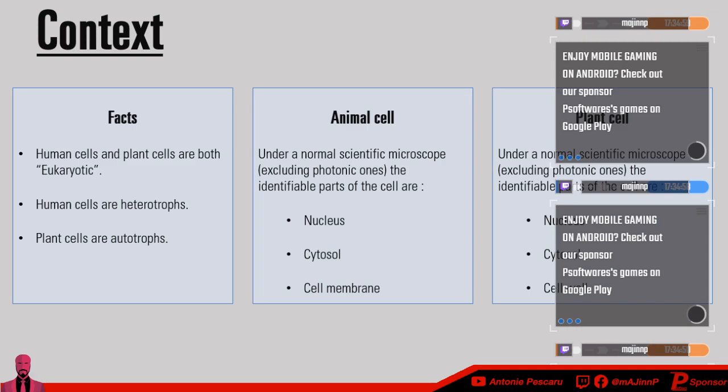But anyways, cells. Human cells in this context, so our cells, what our body is made out of, come from the domain eukarya, meaning that we are eukaryotic. And what does that mean, eukaryotic? Eukaryotic means real nucleus. It means that the cell has a real nucleus, and we're going to see why in the actual microscopy that we're going to be doing later.